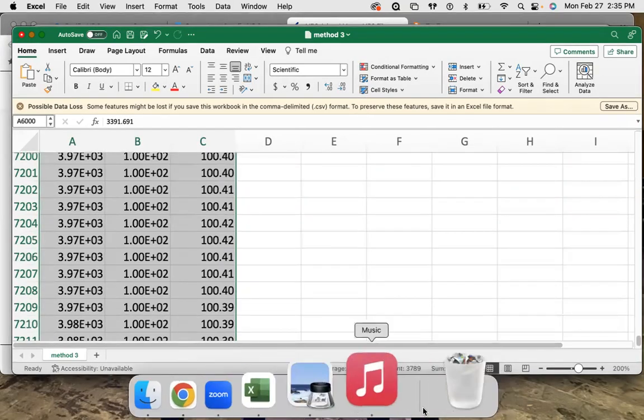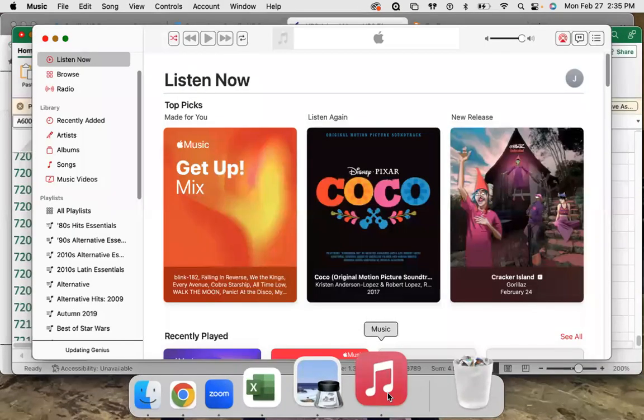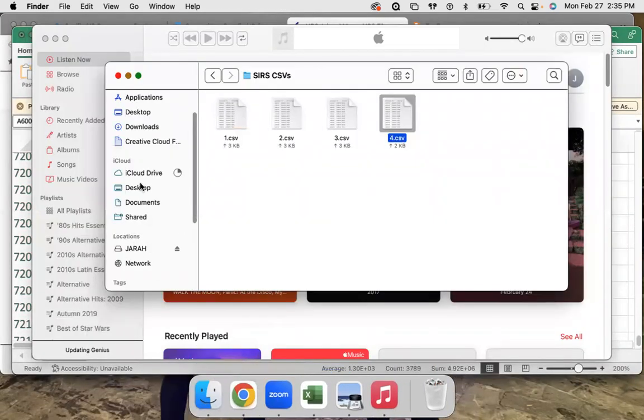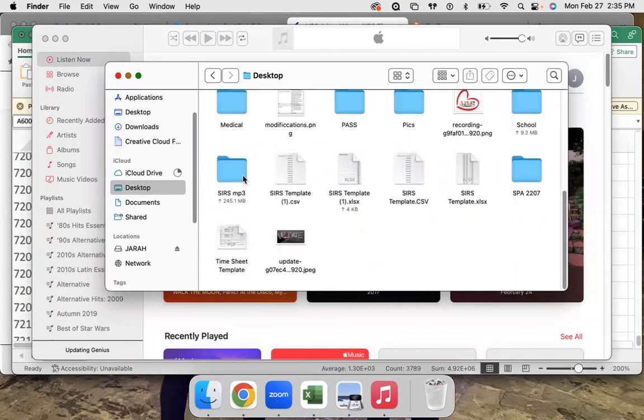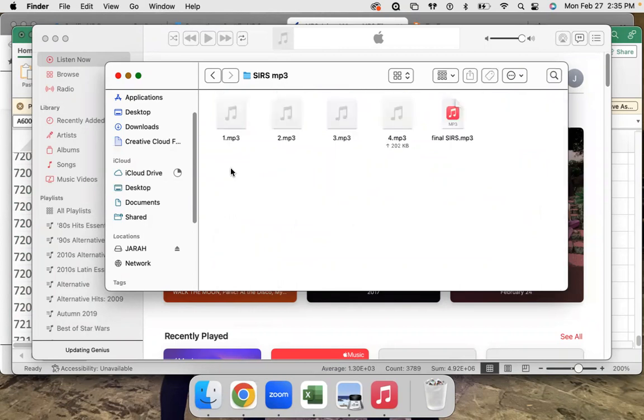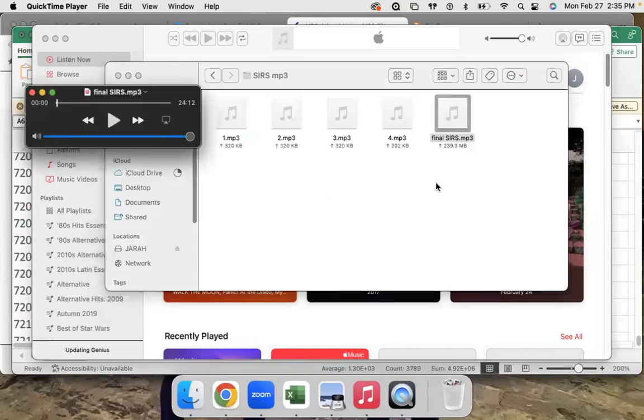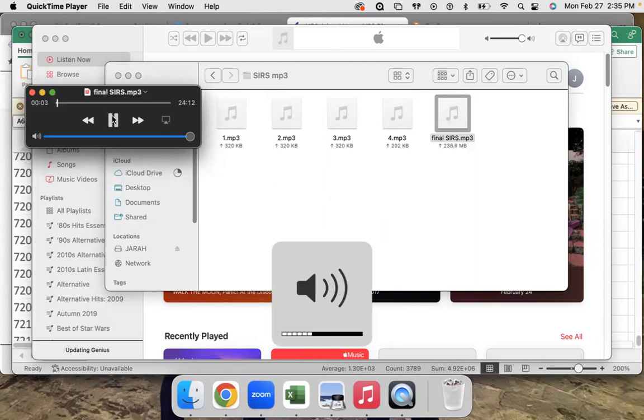And then there will be a large reference tone at the beginning, end, and every 500 wave numbers. And so once you listen to it, the first beep you hear will be the reference peak.